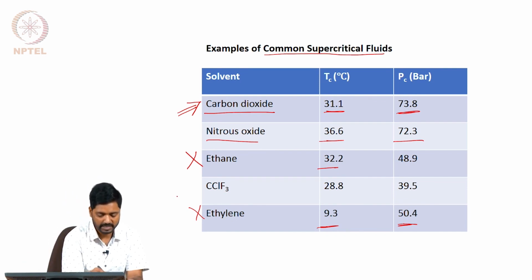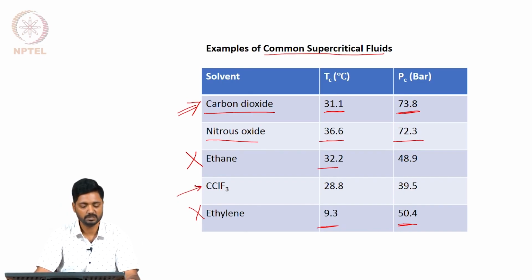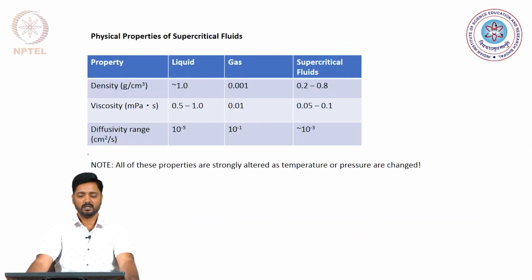Chlorofluorocarbons obviously again, despite their favorable critical temperature and critical pressure values, have environmental drawbacks which inhibit their use as supercritical fluids now.